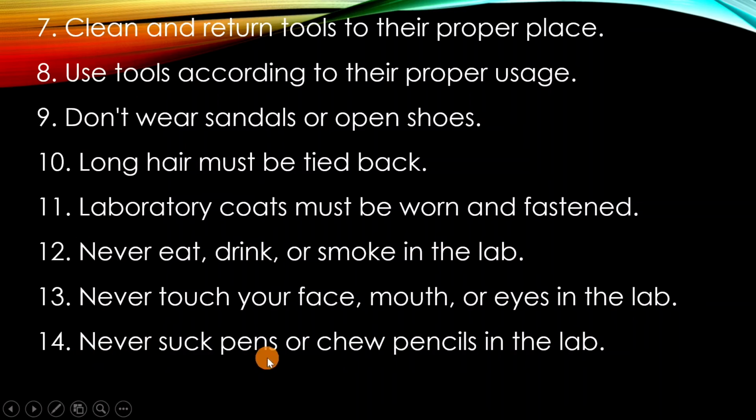Also never suck pens or chew pencils in the laboratory. There are some people with habits of chewing pens or pencils. That is not allowed in the laboratory, because doing so might cause transfer of bacteria or chemicals into their mouth. Okay.